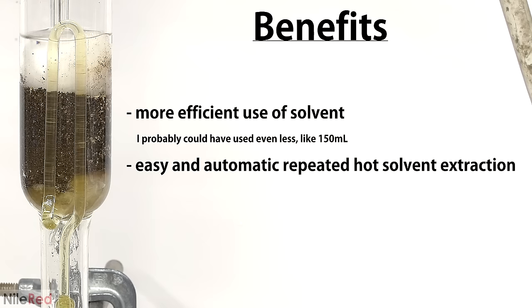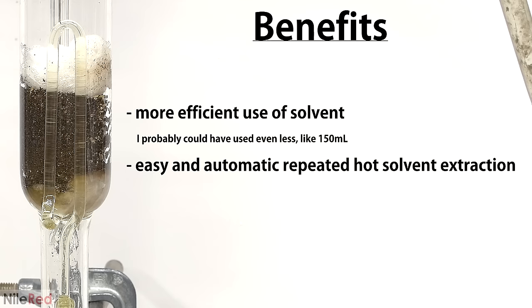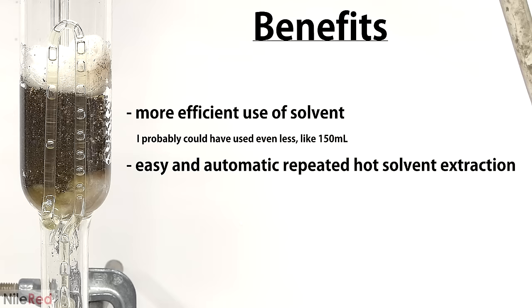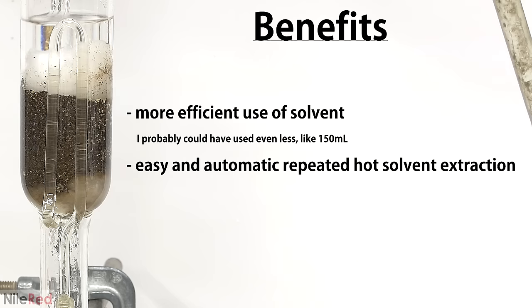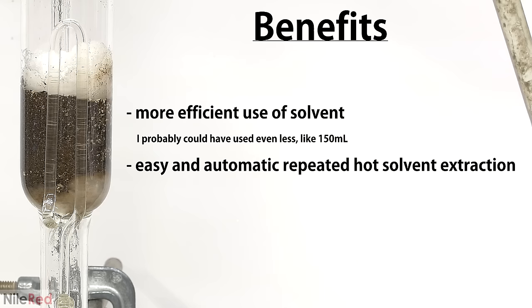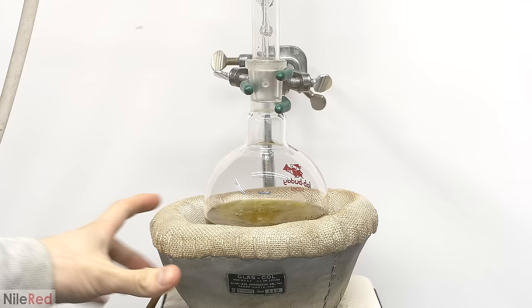So at this point, you can see why the Soxhlet extractor is so useful. It basically allows us to do repeated hot solvent extractions using a relatively small amount of solvent. If I didn't have a Soxhlet, I could just boil the hot pepper in a whole bunch of isopropanol or do manual repeated hot solvent extractions. Both of these options require more solvent and the second one can be a lot of work.